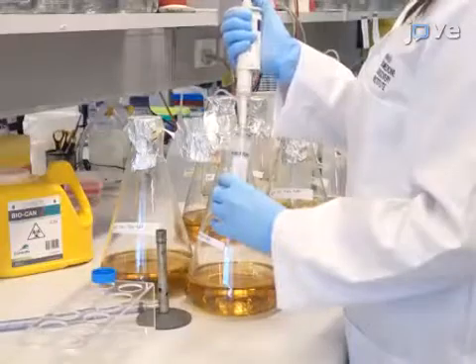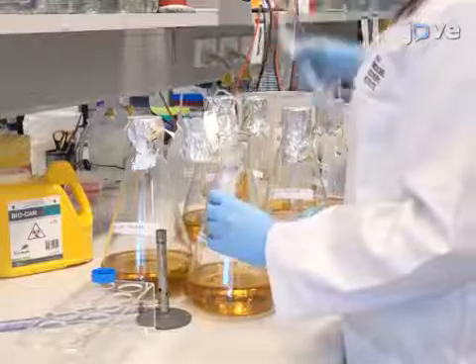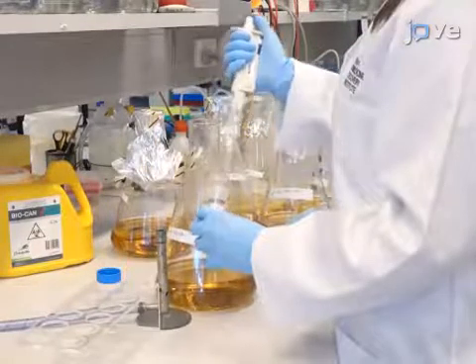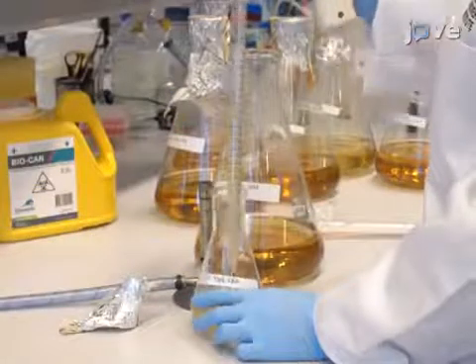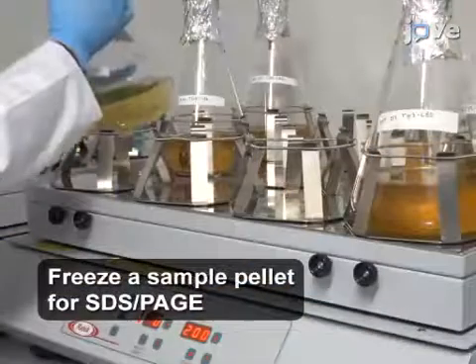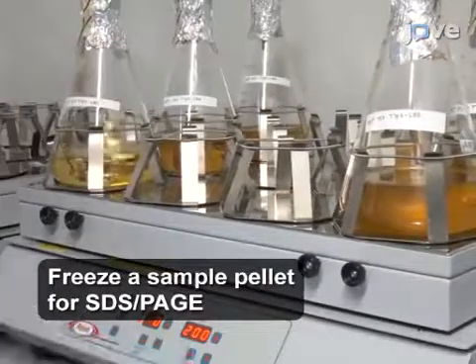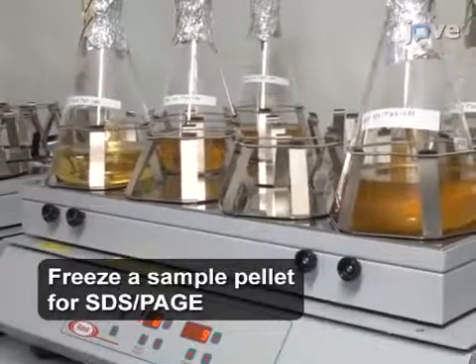Prepare six 2-liter Erlenmeyer flasks containing 800 milliliters of sterile LB broth and 50 micrograms per milliliter of ampicillin. Inoculate each flask with 20 milliliters of the overnight culture. Incubate the flasks at 37 degrees Celsius with continuous shaking at 200 RPM until the OD600 reaches 0.6.